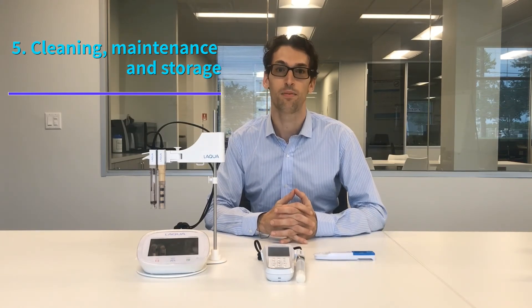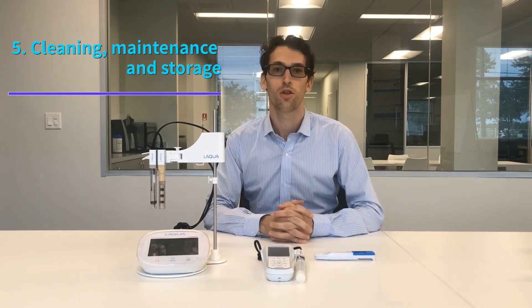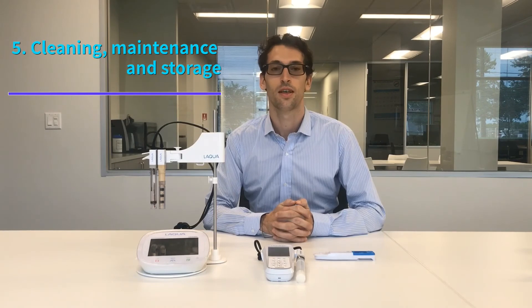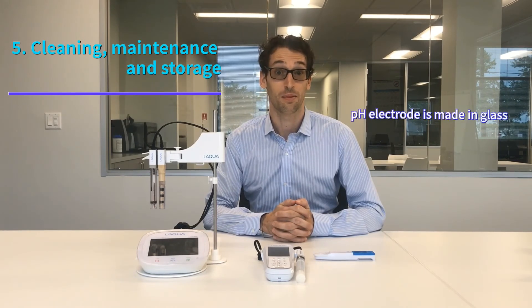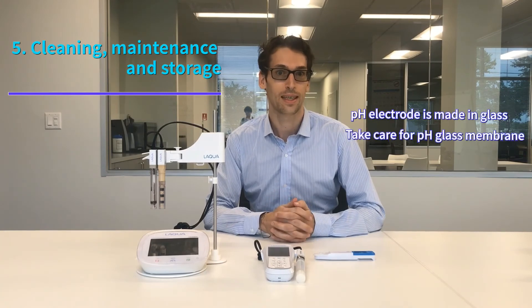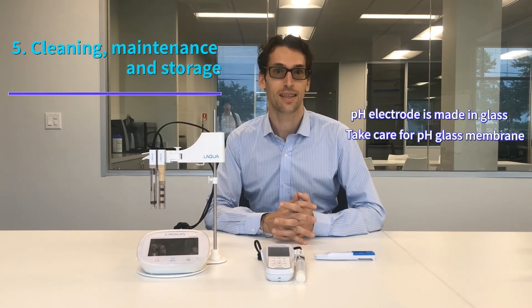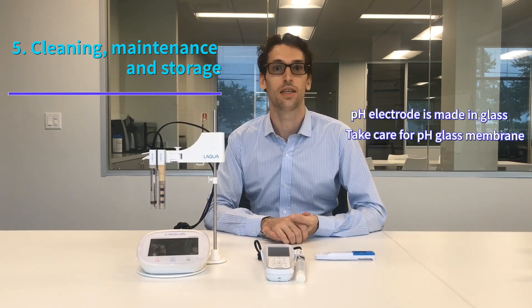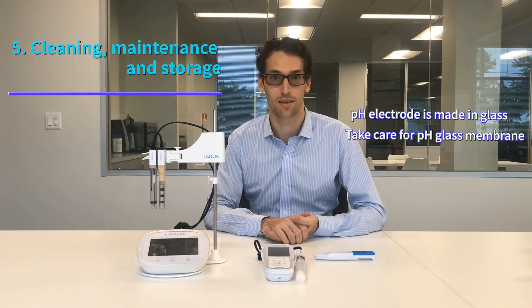Finally, it's important to know that with the Oriba Laqua Twin pH meter, and most pH meters on the market, the pH electrode is made of glass. Because it is made of glass it can be fragile. On the Laqua Twin, it is a very thin layer of glass, and if you apply pressure on it you risk damaging it. So please handle the sensor very carefully.